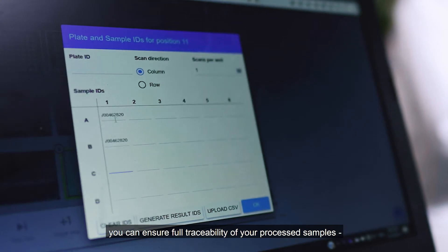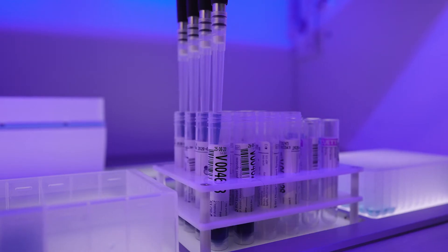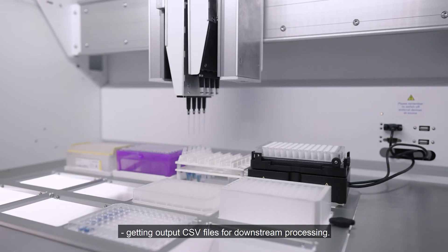You can ensure full traceability of your processed samples, getting output CSV files for downstream processing.